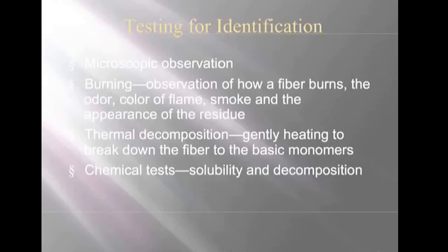The burning is going to be, if you've ever burned something, you know that certain things burn different colors. Well, this is the same thing. The color of the flame actually can tell us a lot about what type of fabric it is. The color of the smoke, thickness of the smoke, and then the residue left behind. Some fabrics will burn completely. Cotton, for example, will leave virtually nothing behind. Whereas burning rayon or burning polyester, polyester is going to leave a little puddle of goo. So that tells us a lot too.